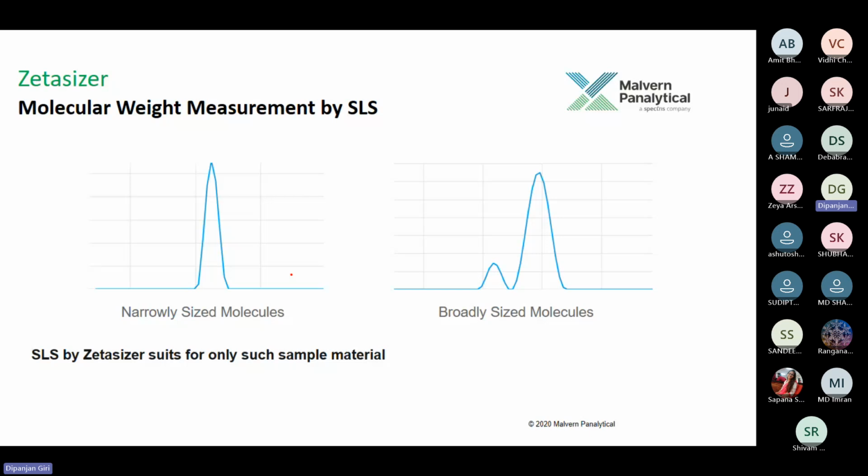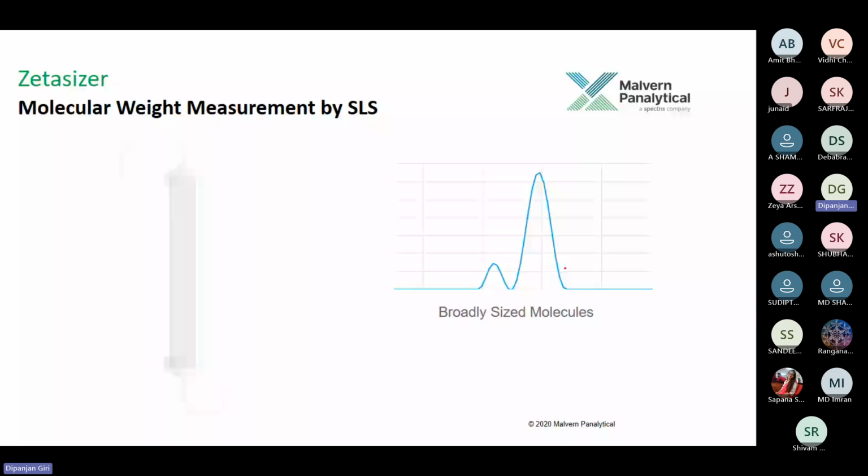For a polydisperse sample, you do not get a linear equation on the points, and the correlation score is very poor, just because of the heterogeneity of the mixture of molecules when exposed to the laser light. Because polydisperse means there are different sizes of polymer, you get fluctuating light intensity and concentration.